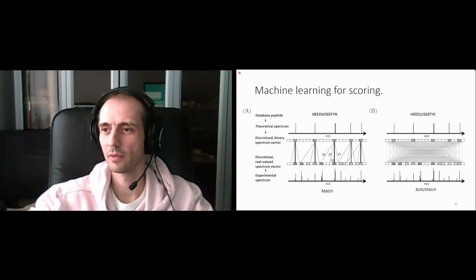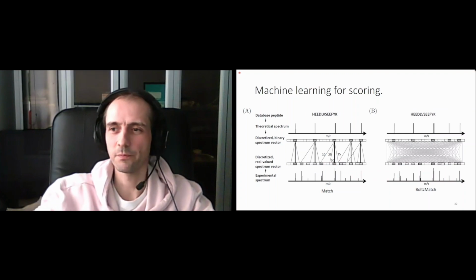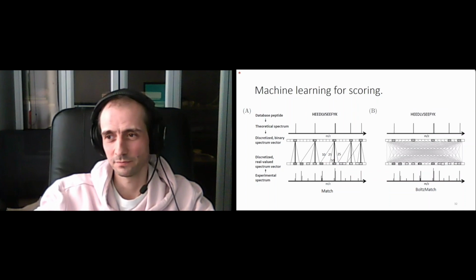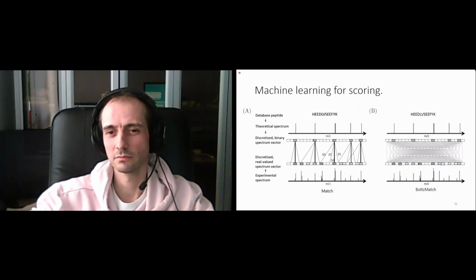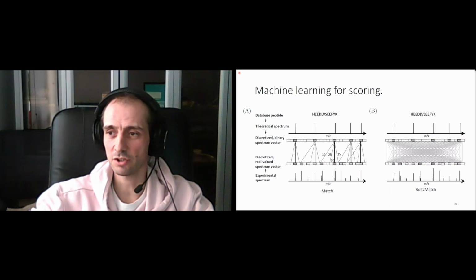Yes. And so how difficult is this? I mean, the same way as you did it for the first time. But for the existing machines, you can now collect on the internet, I guess. Yes. Data sets are merged. Yes. But if a factory makes a new instrument, it means he cannot use your algorithm unless he does a lot of experiments first, and then for the user provides the model. Yeah. Exactly. So you need to calibrate the model for each instrument.